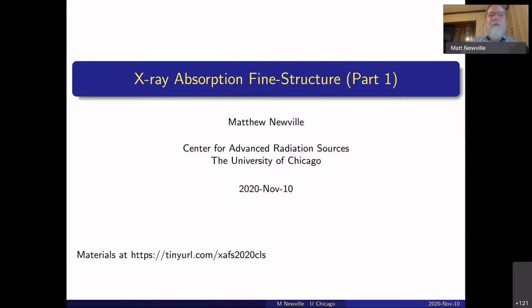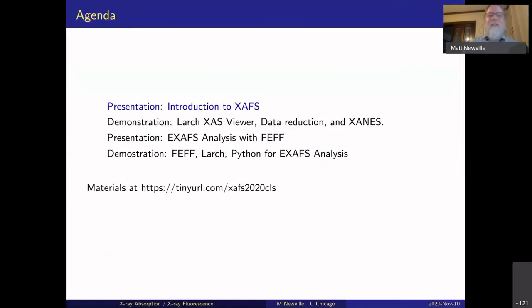Okay, so we start this morning with an introduction to XAS. Now, I know that many of you here, or at least some of the people I saw, are very familiar with XAS. So this will be a quick run through the basics of XAS. And then I'll give a demonstration of data reduction and a little bit of XANES analysis using the Larch XAS Viewer GUI tool. And then I'll give a presentation on using FEFF and doing XAS analysis, shell by shell fitting as it's often called, where you really model the extended XAFS. And then I'll give a demo of that using command line and scripting tools.